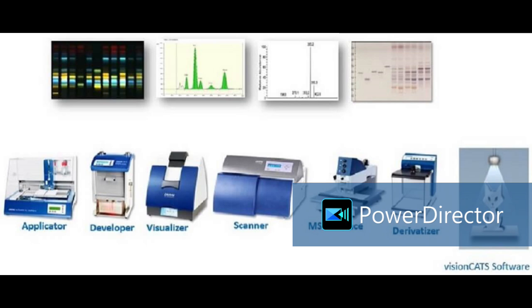Okay. So how effective will your method be with designer drugs? For designer drugs, we can use different derivatizing reagents selective towards a particular drug. So for two different designer drugs of similar skeleton, after derivatization the two will show different color bands. Like one will turn blue, and the other, because of structural difference, will turn yellow. So after derivatization, we can differentiate between designer drugs.